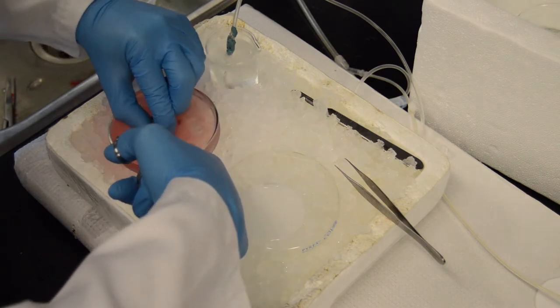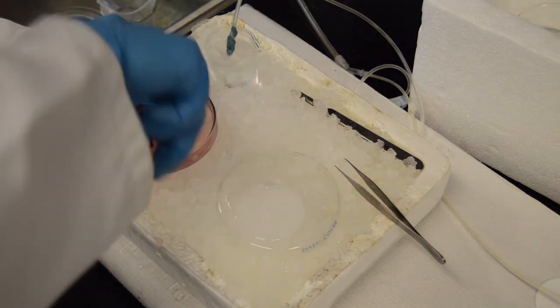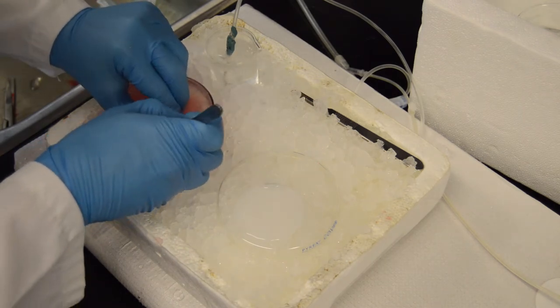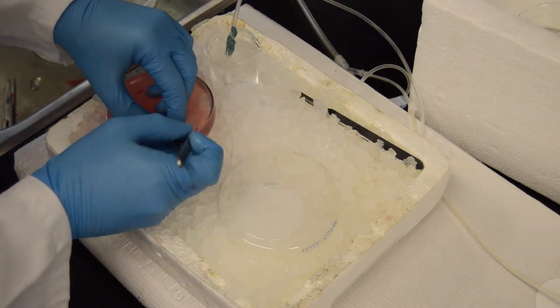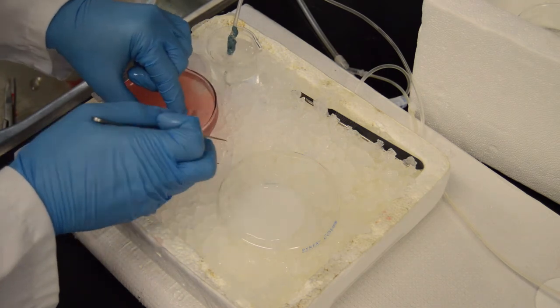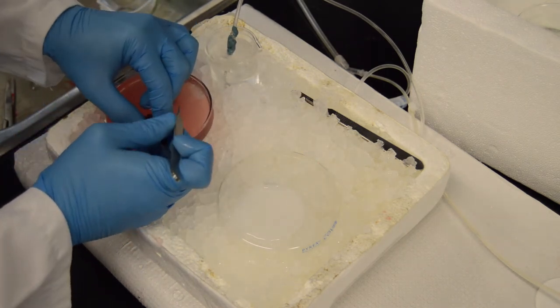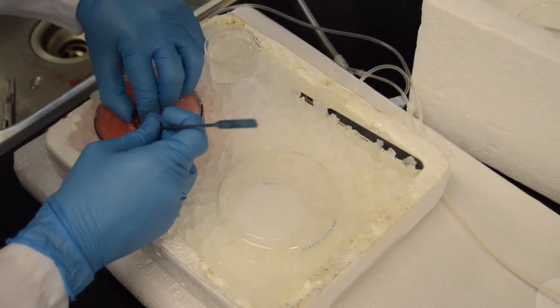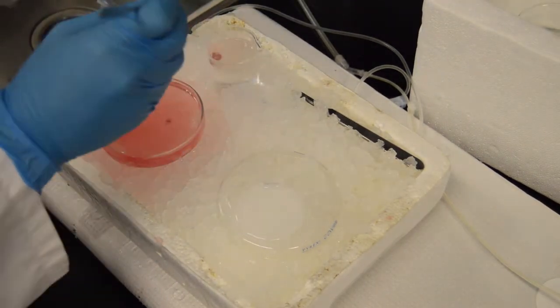In order to prepare the brain for slicing, we first need to extract the brain. To do this, we make an incision along the longitudinal fissure of the skull, and then pull back the pieces of the skull and meninges lying underneath. We then carefully extract the brain and place it into bubbling carbogen ACSF.